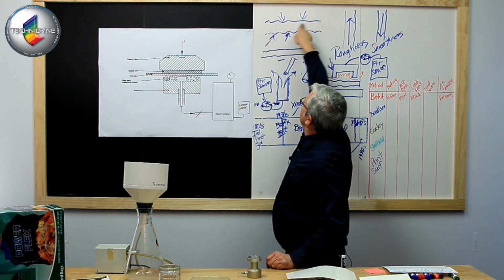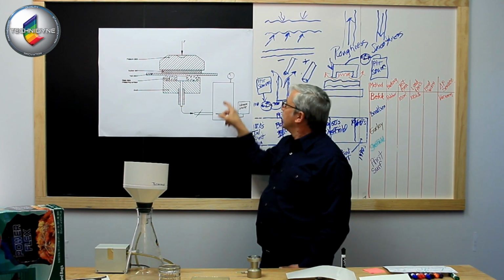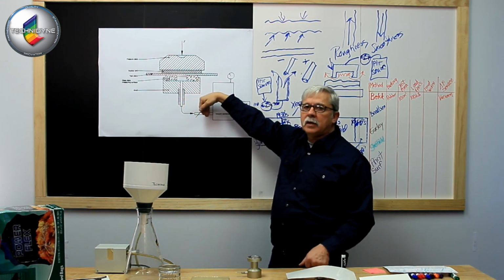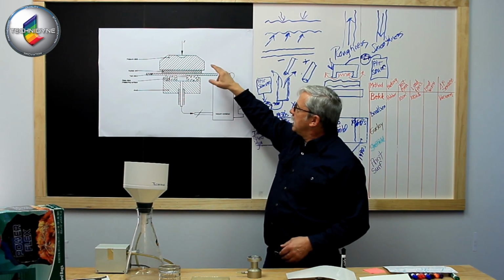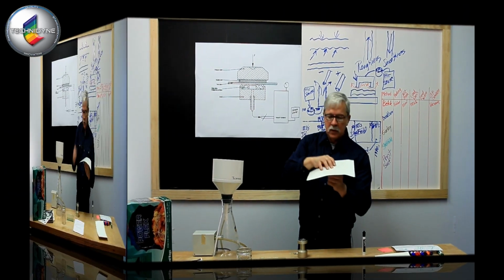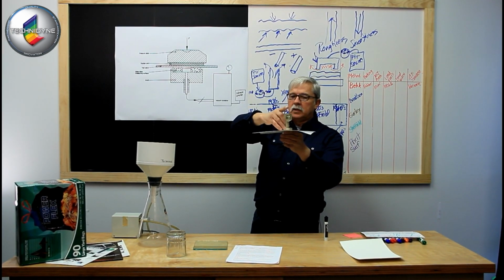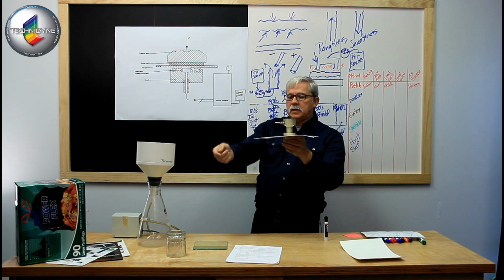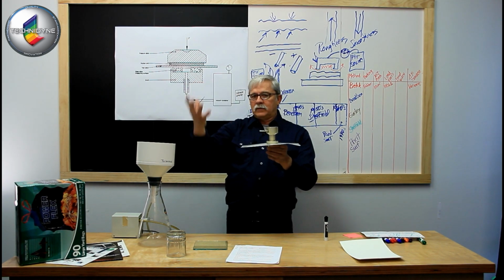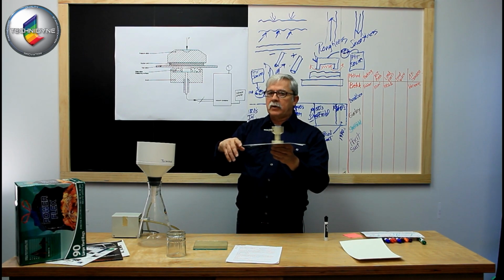If my sample has a lot of undulations in it, I might get a lot of air leakage through my pathway here. If it's a very smooth surface, I might get just a small amount of air that goes through my system. But the key is to support the sample with a firm backing, invert the measurement head on top, and create a vacuum on this side of the sheet, so that I have an area of low pressure in my chamber, and an area of high pressure, which is in my laboratory.